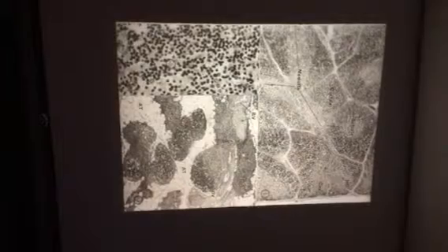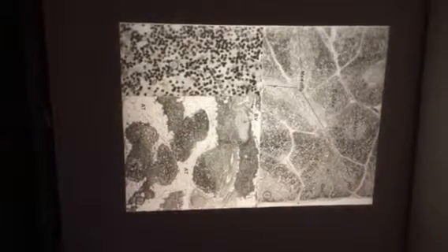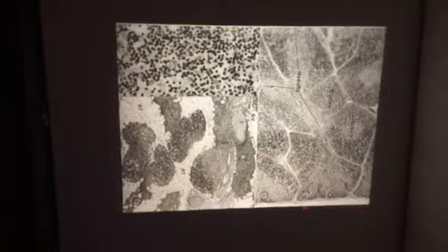He's answering. This is going to be on the lab record. Not spleen, because the spleen does not have a medulla or a cortex in the right area. Thymus. We have a delicate capsule, we have trabecula. It's divided up into lobules, which you do not find in the spleen. We have a cortex and then a centralized medulla.